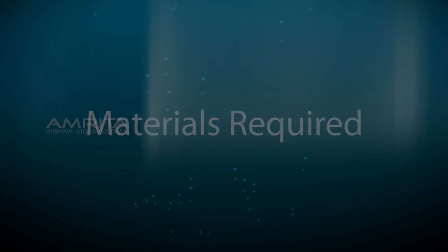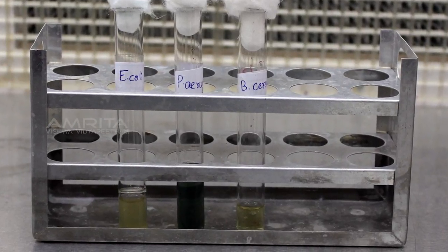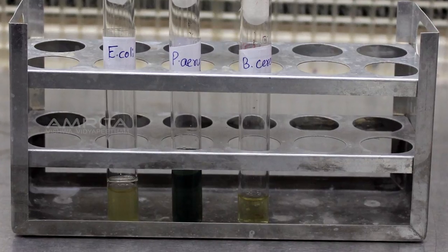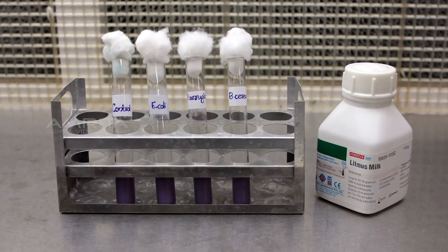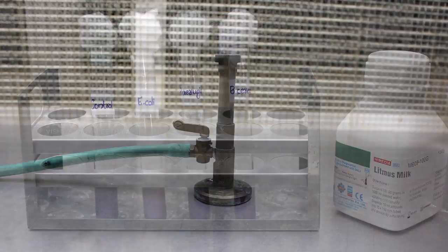Materials required: Tryptic soy broth culture of different microorganisms, inoculating loop, Litmus milk broth, Bunsen burner.